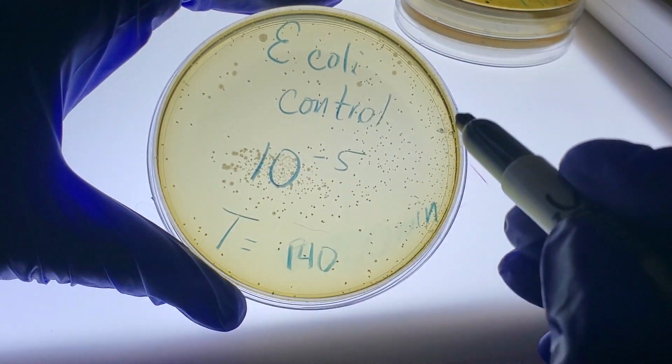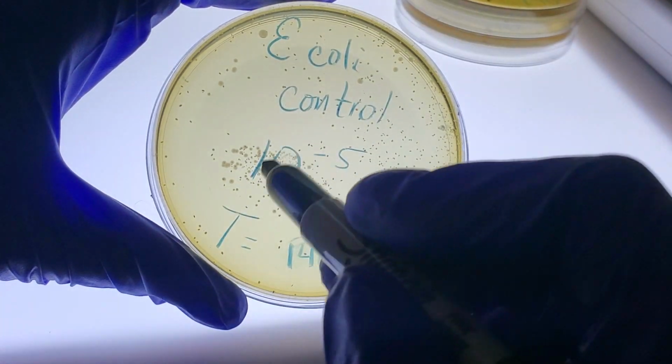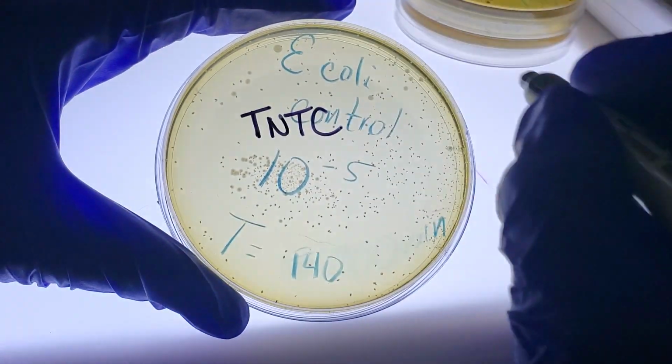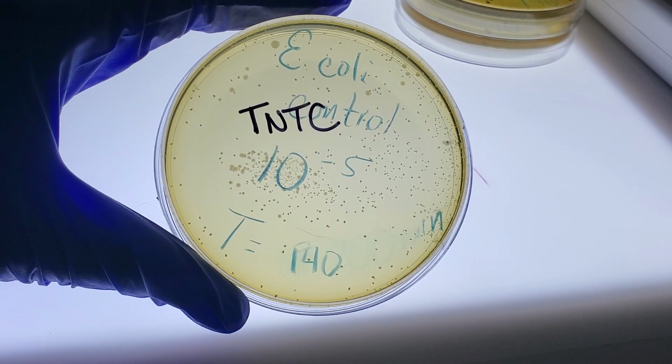There are clusters of colonies that are so tight that it would be very difficult to count. And this plate clearly has over 300 colonies, even though the colonies are very small.